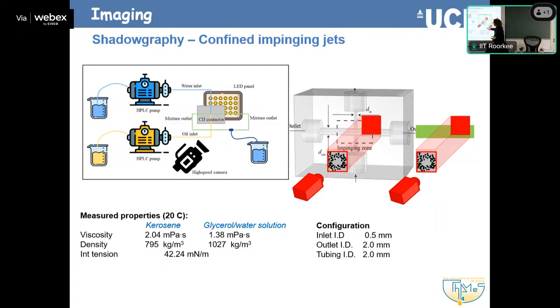These ones are confined. And William the student did a very fancy drawing here of a schematic of the setup, but basically we have the pumps, we have fluids, and that's where they join. We have the light, we have the camera.